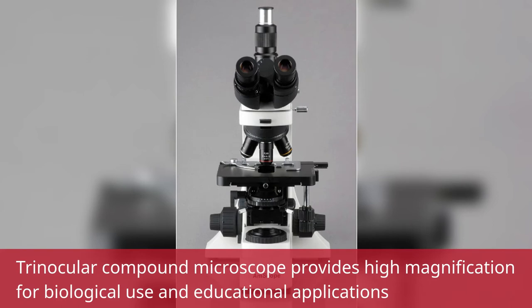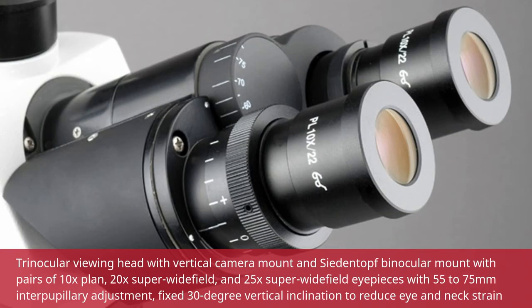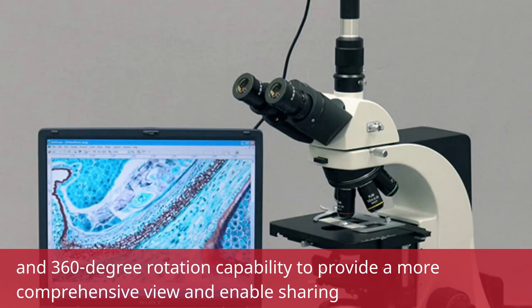This Trinocular Compound Microscope provides high magnification for biological use and educational applications. The Trinocular Viewing Head features a vertical camera mount and Siedentopf Binocular Mount with pairs of 10X Plan, 20X Super Widefield, and 25X Super Widefield Eyepieces with 55–75mm interpupillary adjustment, a fixed 30-degree vertical inclination to reduce eye and neck strain, and 360-degree rotation capability to provide a more comprehensive view and enable sharing.